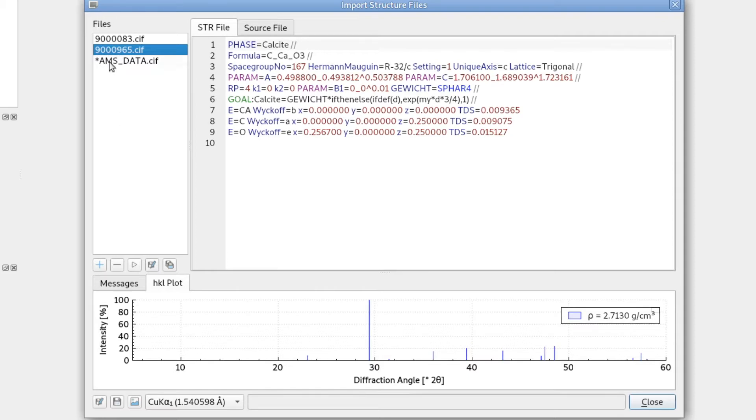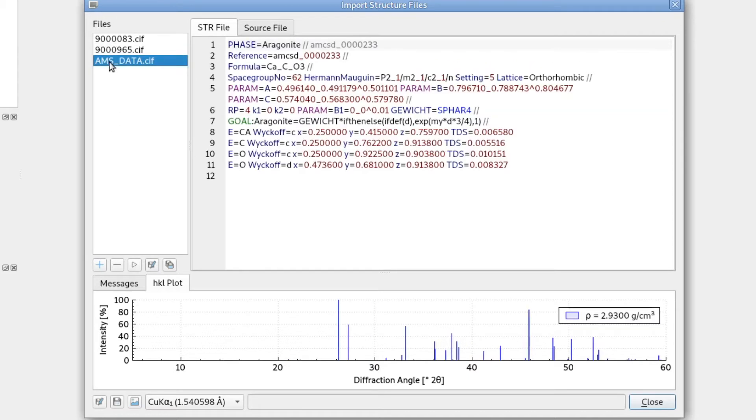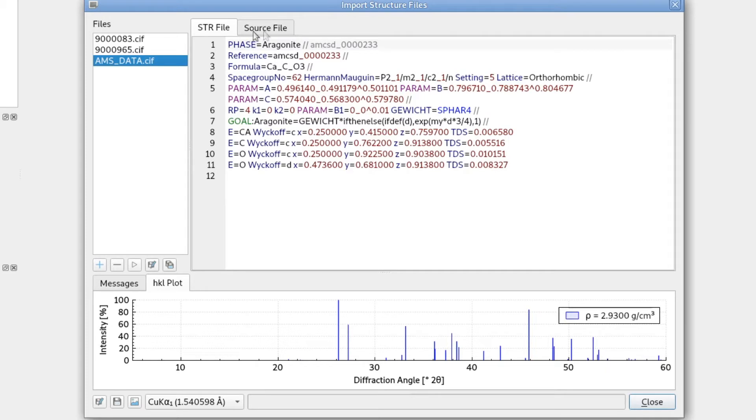And let's try the third one. Also here, aragonite, we will see the density and the stick pattern. So all files were converted to the structure file format automatically. We don't have to do anything.